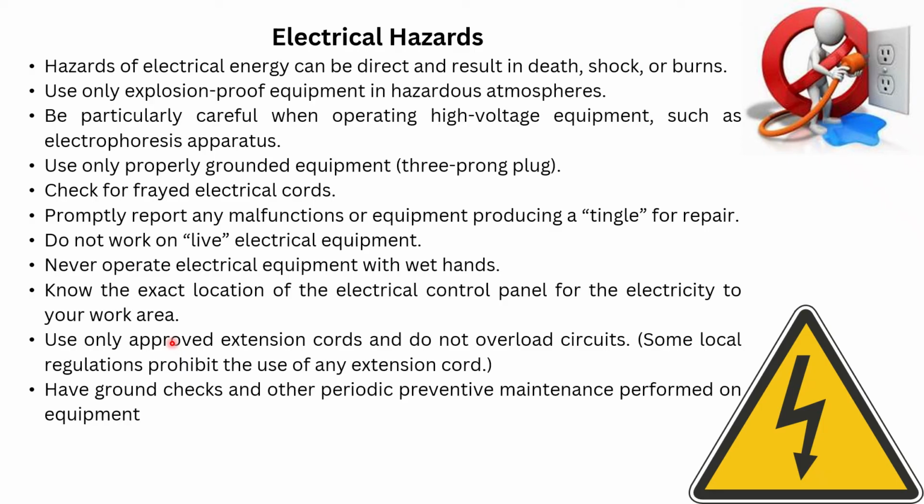Do not work on live electrical equipment. Never operate electric equipment with wet hands. Know the exact location of the electrical control panel for the electricity to your work area. Use only approved extension cords in temporary applications and do not overload circuits. Have ground, polarity, and leakage checks and other periodic preventive maintenance performed on outlets and equipment.